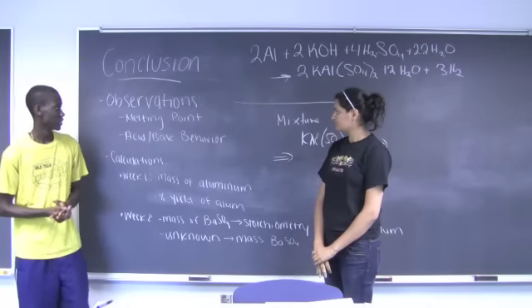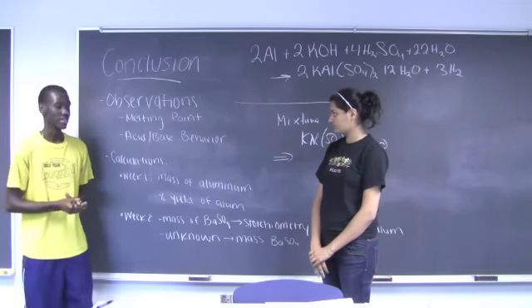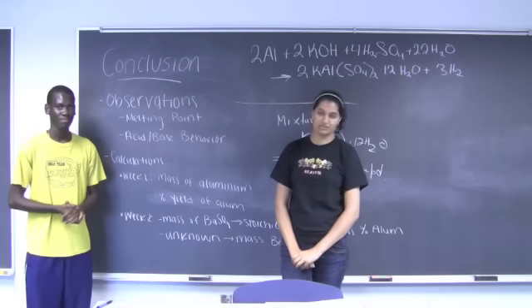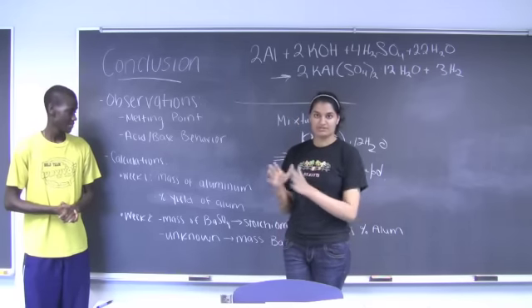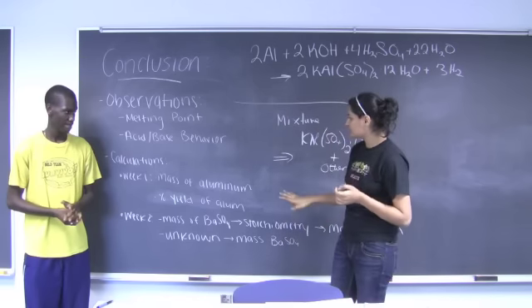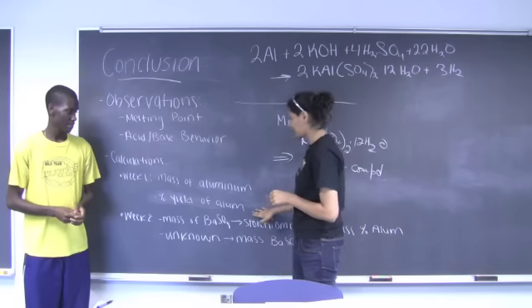Alright guys, so in conclusion, throughout the point of this lab, you should have been able to determine the melting point as well as the acid-base behavior of the alum. Okay, and guys, just make sure that you're going to keep track of all your data in your lab books neatly, because this week we're going to have 2 separate experiments, the first one being the synthesizing and the second one being analyzing. In the first week, you're going to be determining the mass of the aluminum, which is going to help you determine the percent yield of the alum.